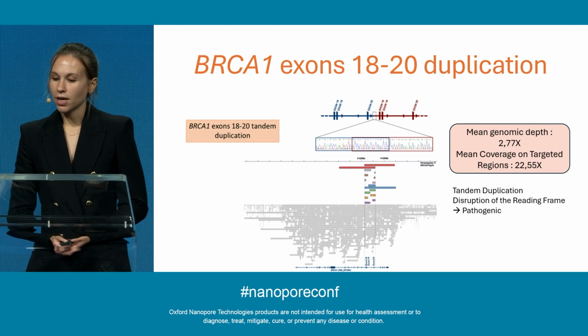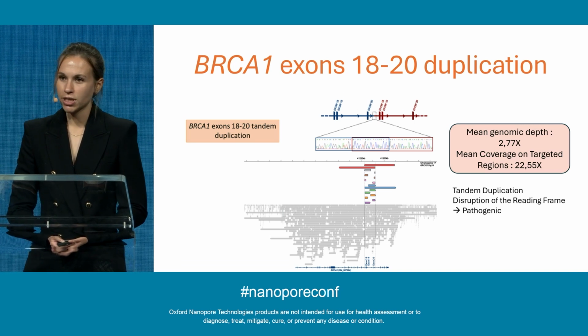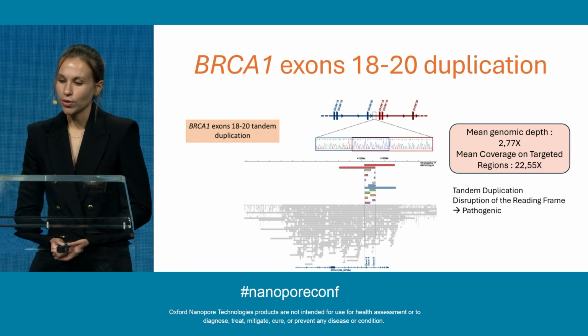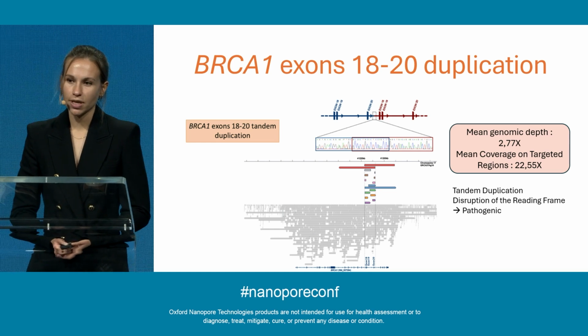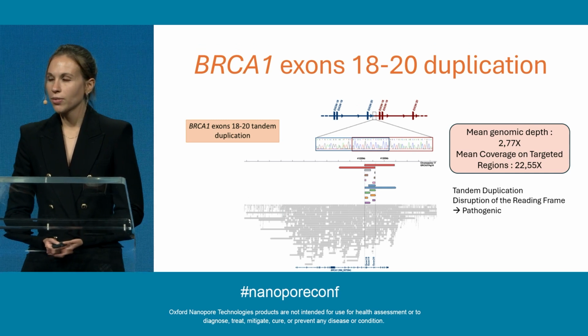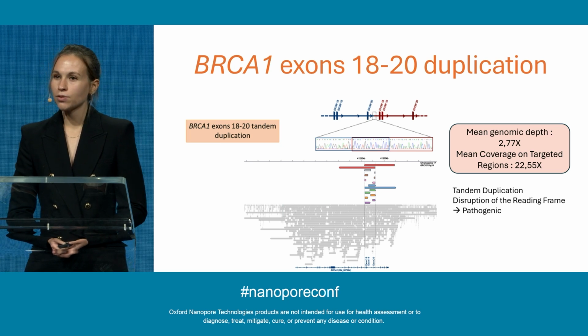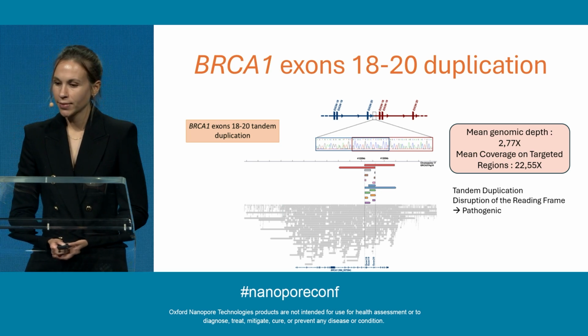And so with this sequencing, we were also able to detect the breakpoints with very good precision. And this allowed us to perform Sanger sequencing to confirm this event and to classify this variant as pathogenic. So within 10 days in total, we were able to go back to the clinicians and confirm that she was carrying a pathogenic variant in BRCA1. And this was really important because another patient was eligible for surgery.